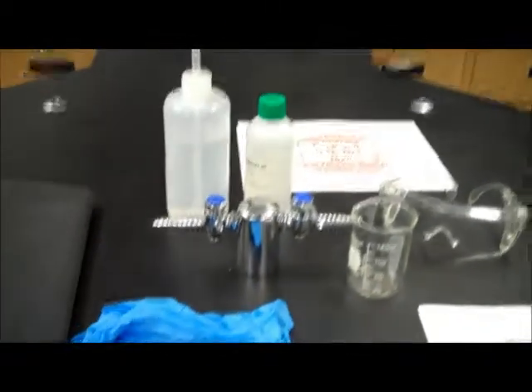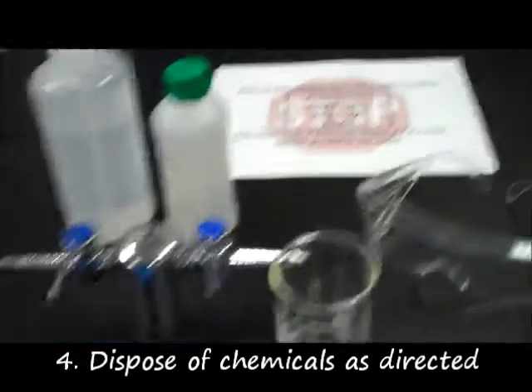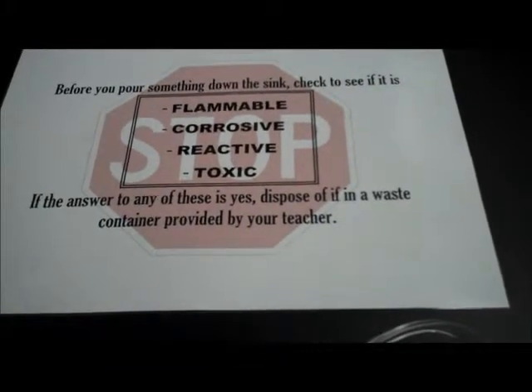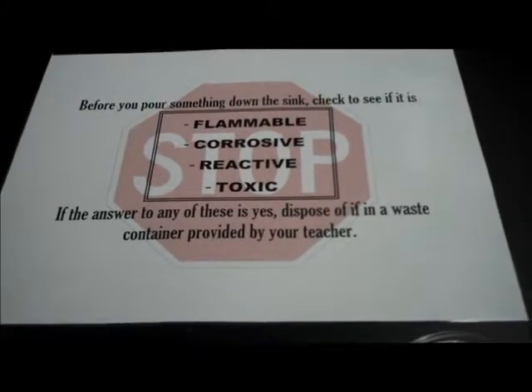In the third situation, you just finished a lab and you're ready to clean up. When you're cleaning up a lab, it's important that you put chemicals where they belong. If you're dealing with chemicals that are either flammable, corrosive, reactive, or toxic, they can't go down the drain. They can't be poured into the sink, even if they're liquid.